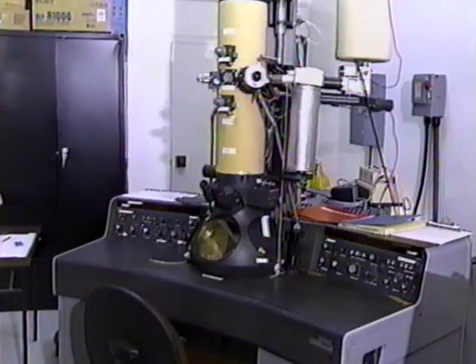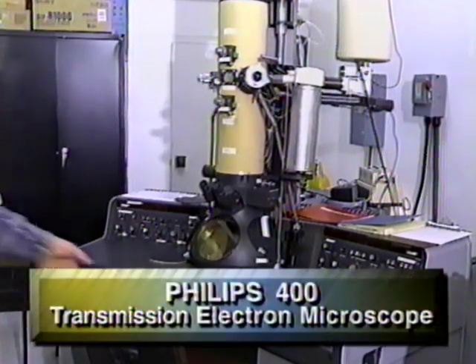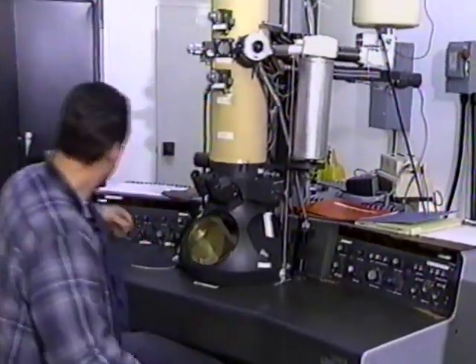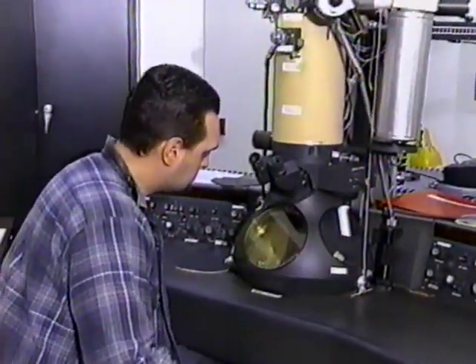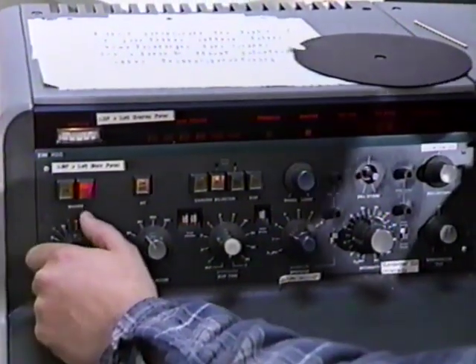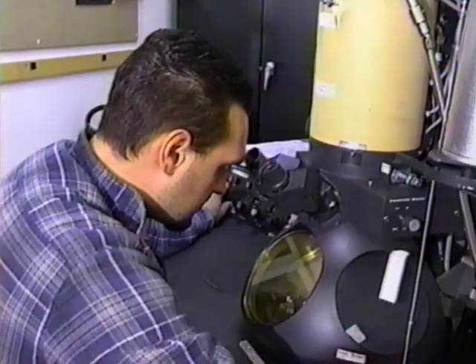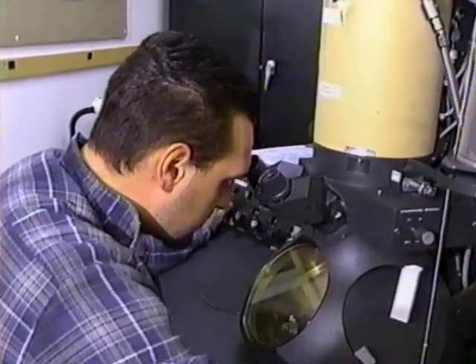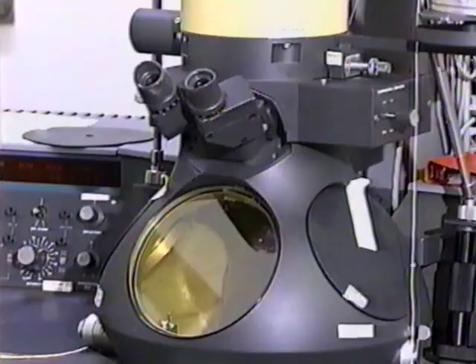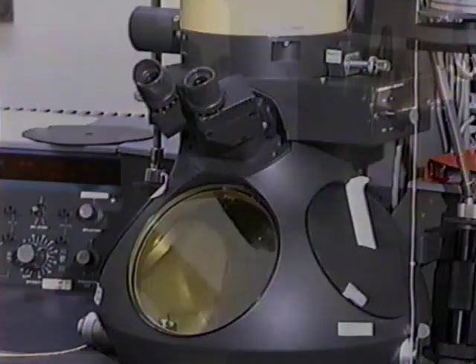And of course Shelley Mettler, one of our students who now has a marvelous job at Gladstone Institute. This is our Philips 400 transmission microscope, and again Jason Murphy there is looking at heart tissue, so he can look at thin sections where the electron beam goes through it. This microscope was donated by Philips, the maker of that particular microscope, and this microscope runs about $300,000. So these are not inexpensive instruments, and so we have to really rely on the donations.